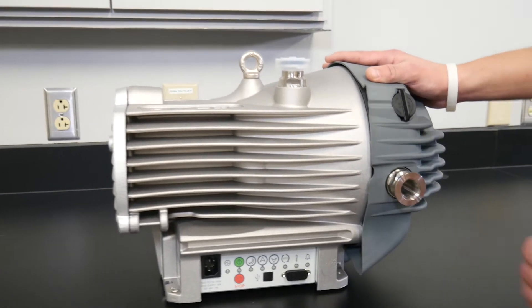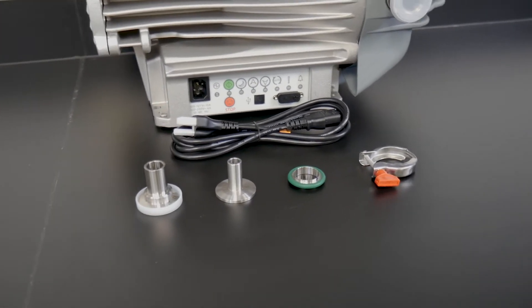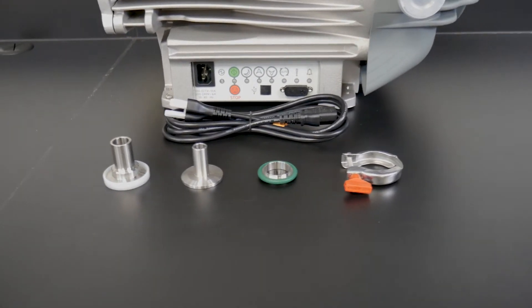Next, unpack the parts included with your vacuum pump. The parts list might be slightly different from other models, so check the manual if you're not sure.